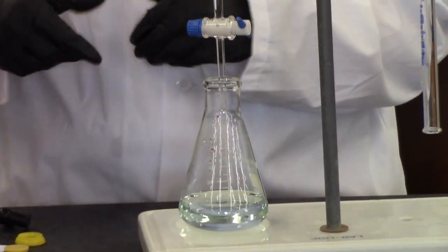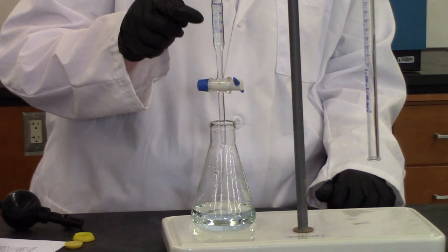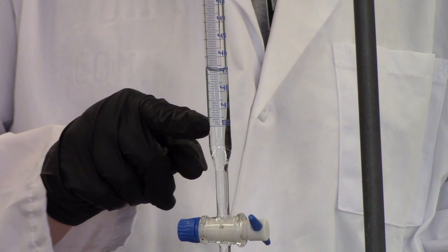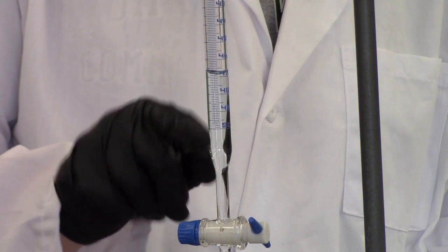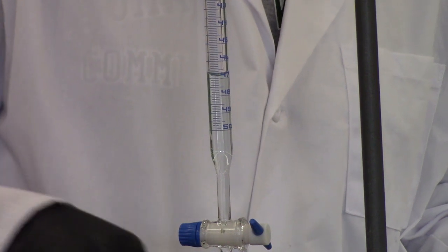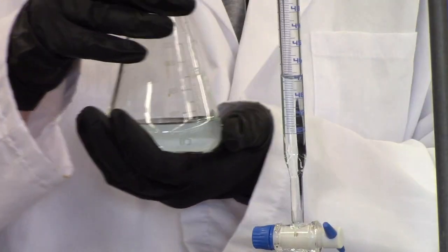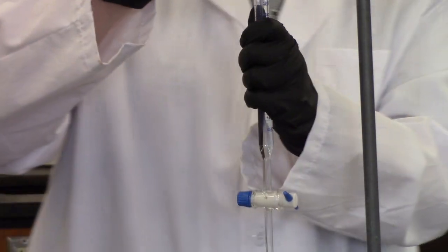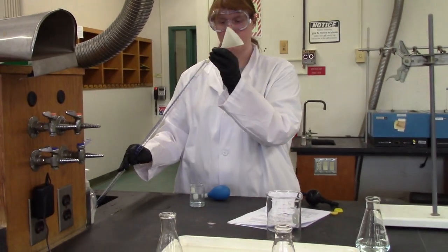So we started this experiment at a volume of about 3.68 milliliters, and I've added quite a lot, okay? You can see the volume of my liquid is here now. I'm close to the 50 milliliter mark. I don't want to go past this mark, because if I let it drain past that, I can't measure it, and that means I don't know what the volume is, okay? So when you get close to 50, if you have this situation happen, this is one of the unknowns. They are each a different concentration. And it just happens this one needs a lot of base. So I'm gonna remove my sample, and I'm gonna take this out, and I'm gonna refill it using the same technique we already showed you with my base.